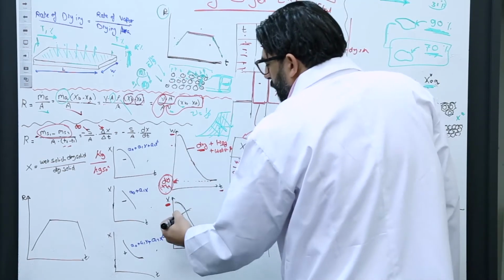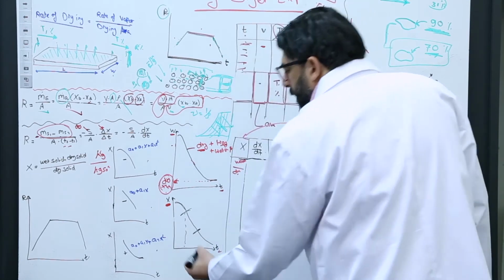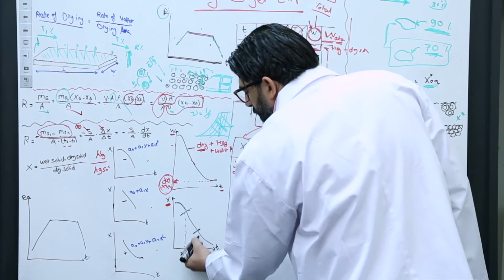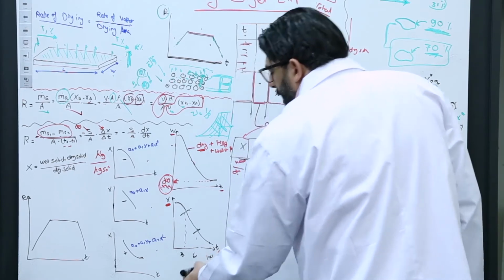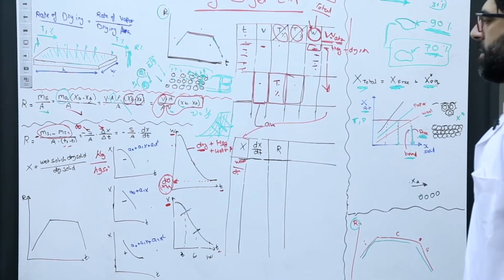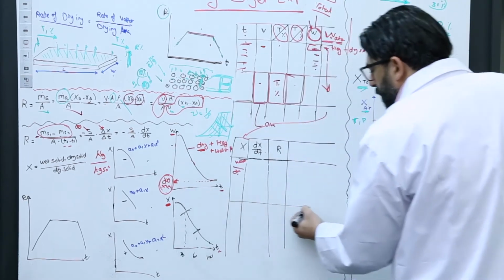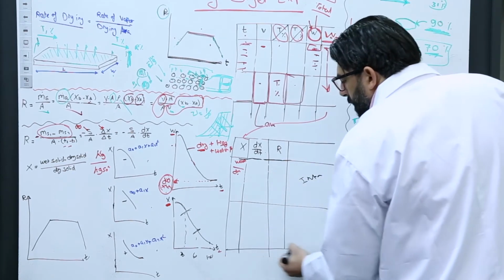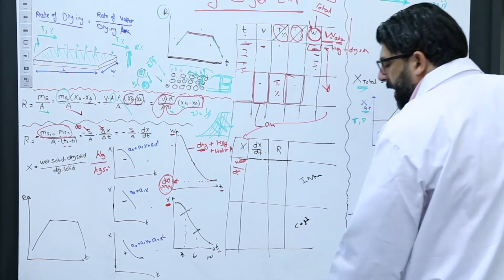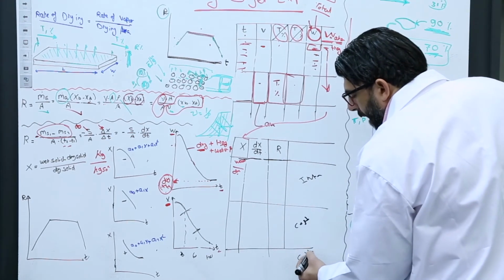you can differentiate, for example, this is from time 0 to time 30. Okay? And this from time 30 to time 60, for example. And from time 60 to 120. I'm just giving examples. So now X and time, okay? So you can differentiate. This part is for the initial, this part is for the constant on the Excel sheet, and the third part for the falling.